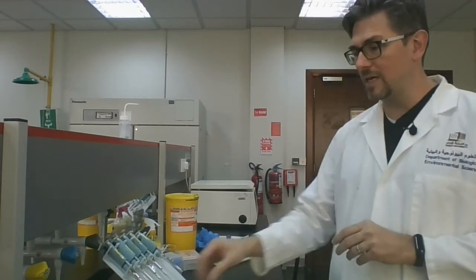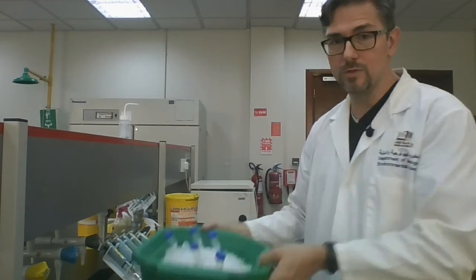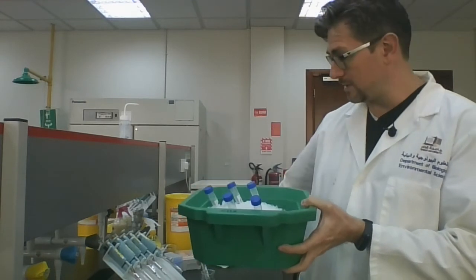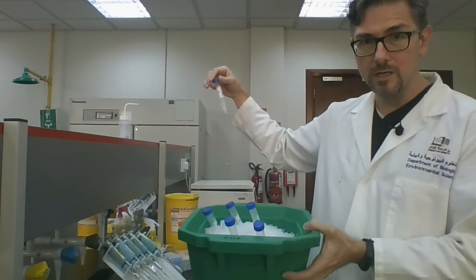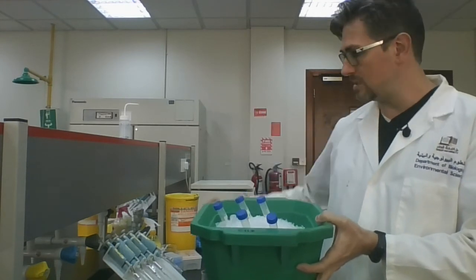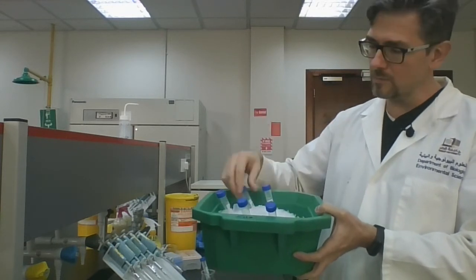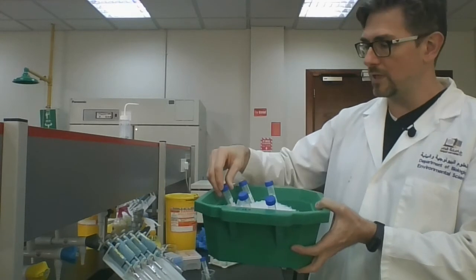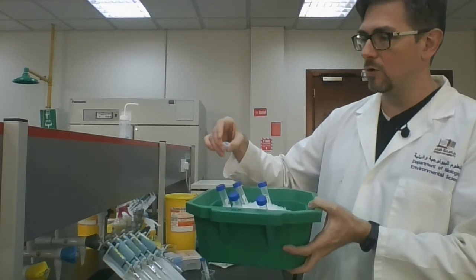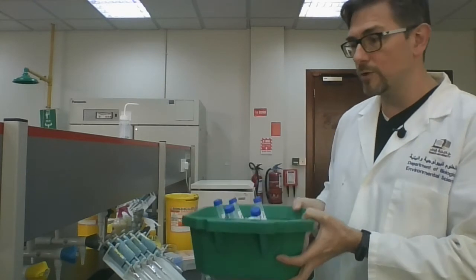Okay. Now, once you're in the lab, the thing you will have to do is check to see what solutions you have. You have solution A on ice. We have an ice bucket with a whole bunch of solutions. So you have solution A in here, and there's solution C. Solution B contains SDS, so that's going to be kept at room temperature. You don't want to put SDS on ice because then it will precipitate out, and so you won't have SDS in solution. So solution B should stay at room temperature. Okay. You also have your 100% ethanol in here and your 70% ethanol in here, as well as your 1X TE that's already been premixed for you, so you don't have to do that, and your 1X TER, so that's the TE with the RNase enzyme, okay? So those are ready for you to go.